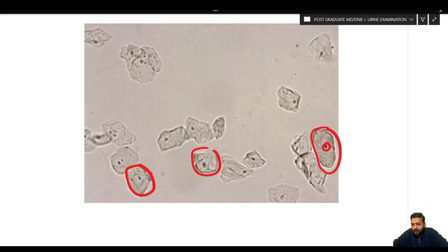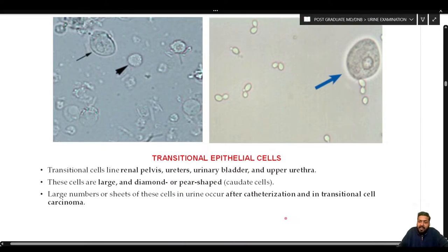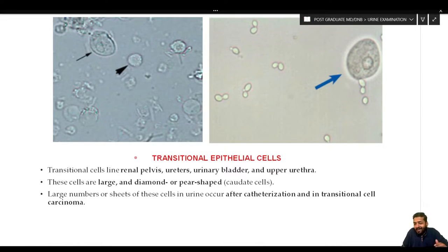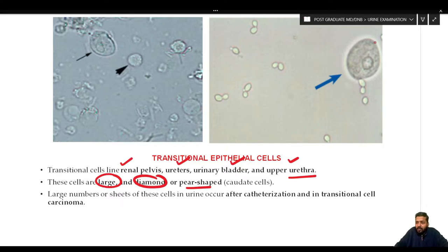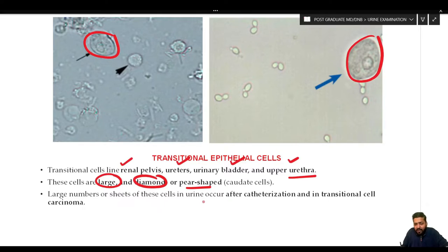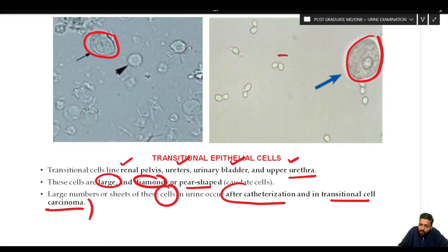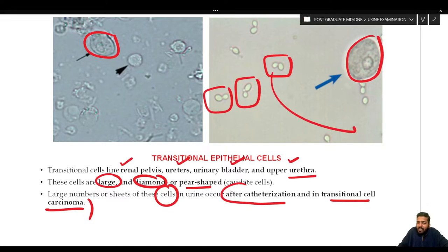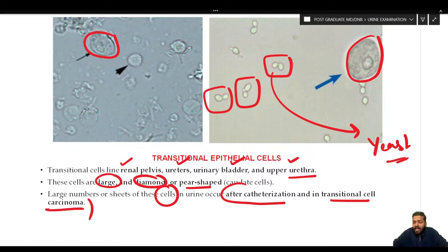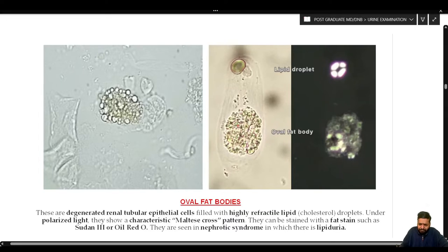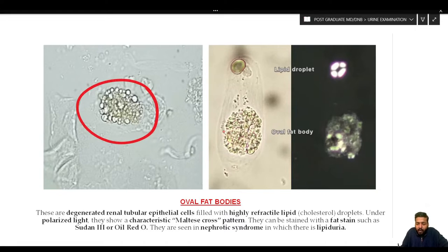Transitional epithelial cells line the renal pelvis, ureter, bladder, and upper urethra. These cells are large, diamond- or pear-shaped, and larger than renal epithelial cells. Large numbers and sheets of these cells are seen after catheterization and in transitional cell carcinoma. Also sometimes visible in the same slide are budding yeast cells, which will be discussed further under organisms.